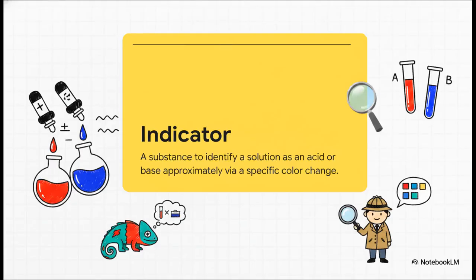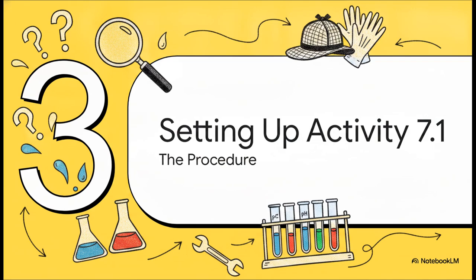So if we drop these into our unknown solutions, what do you actually expect to happen? Well, by definition, an indicator is just a substance used to approximately identify a solution as an acid or a base, just by observing a specific color change. Think of them like chemical informants. When they run into an acid, they wear one disguise, but the second they hit a base, boom, they instantly change into another. All right, on to Section 3, setting up Activity 7.1.